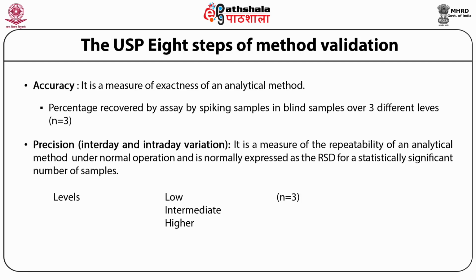Now it has to be repeated intraday, within the day and between the days. So intraday and interday variation is analyzed by injecting 3 times, n equal to 3, and calculating the RSD between them, and it should be within the limit criteria of ICH guidelines.